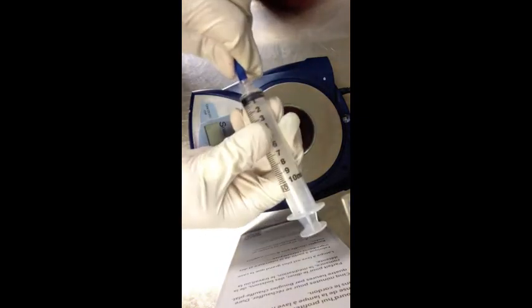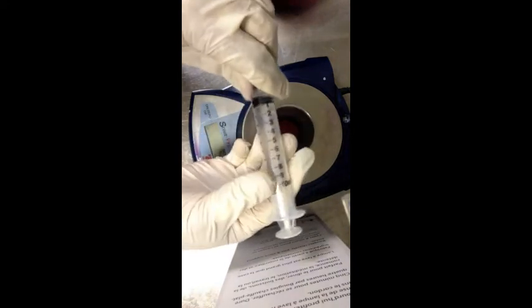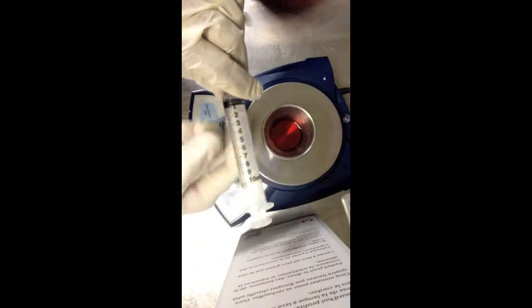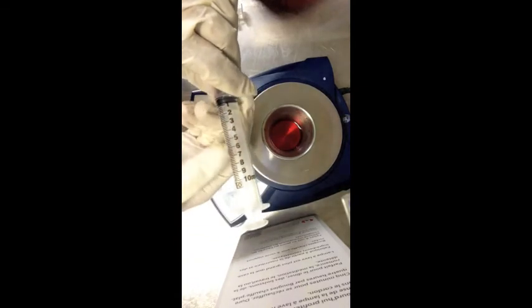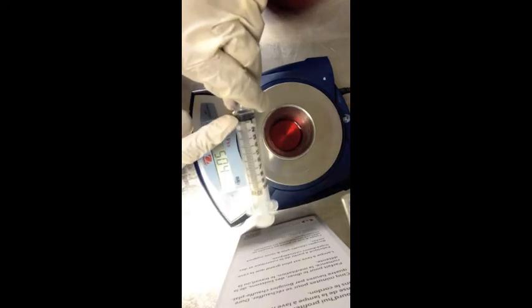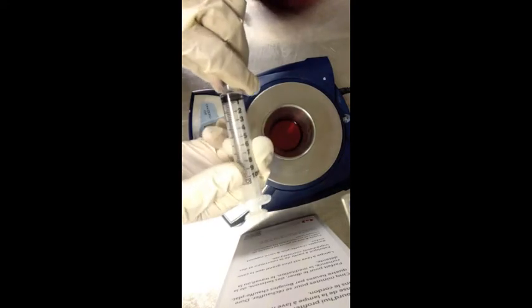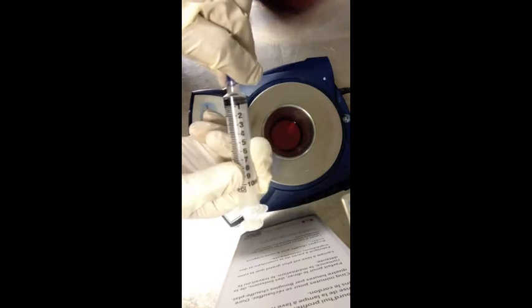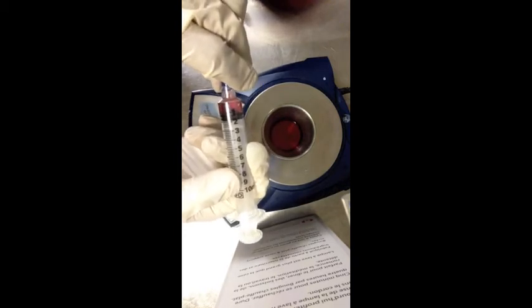This machine can fill much faster. If we wanted to fill it to 7 ml, we could just set the machine to 7 ml. In one stroke, it would fill it. But I'm doing it at 1 ml so that you can read the numbers as it goes up with each stroke, just to see that it's a positive displacement so it pushes the plunger forward.